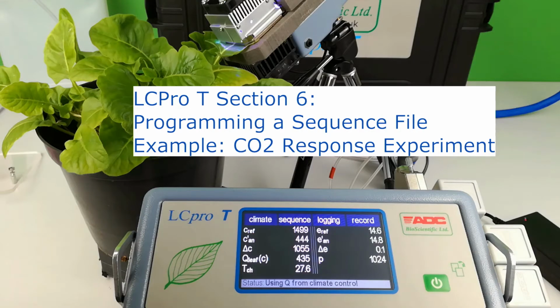Section 6. Programming a sequence file. Example, CO2 response experiment. To control the CO2, first ensure that columns 1 and 4 are filled with fresh white soda lime chemical.